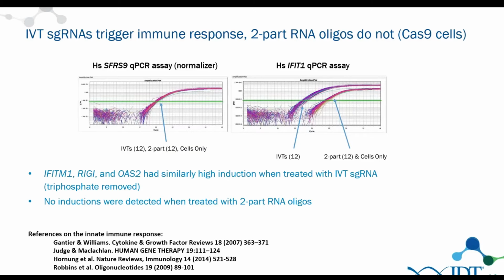So depending on the type of cells that you're working with, we have performed most of our work with HEK293 cells or HeLa cells. Those are quite stable, meaning that they have lost part of the pathway. They're not going to die, but they just might look a little sick, to say it that way. When we go to more complex cells, primary cells for example, those cells are much more affected. This is feedback that we get from the field and from our collaborators worldwide.